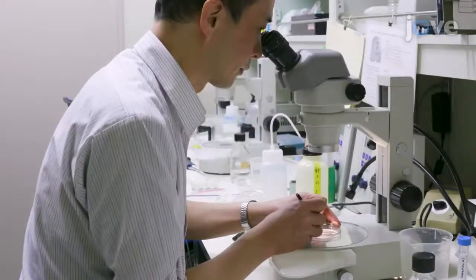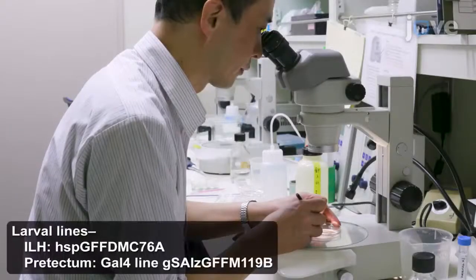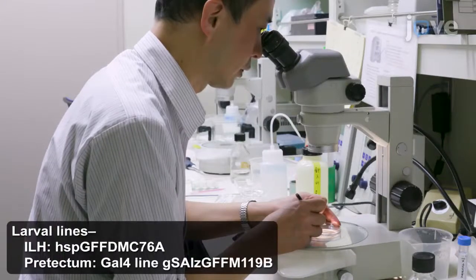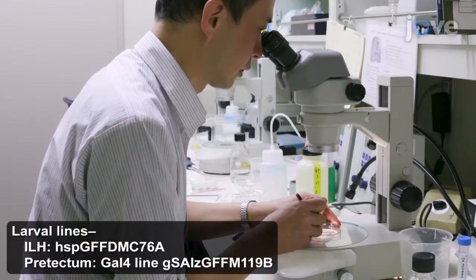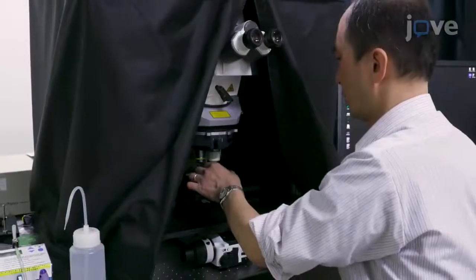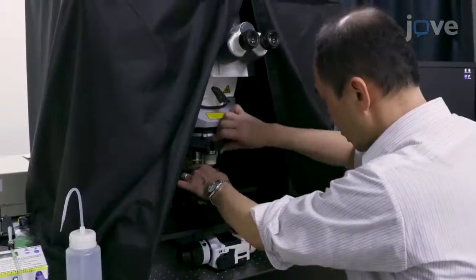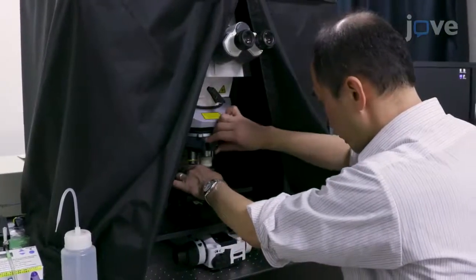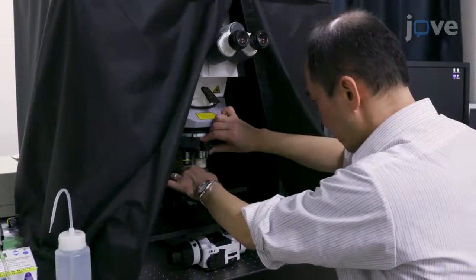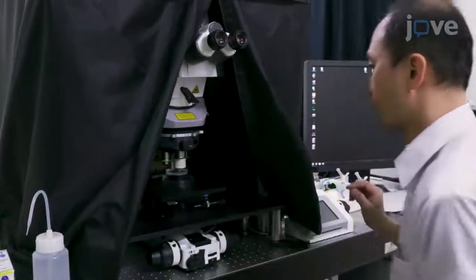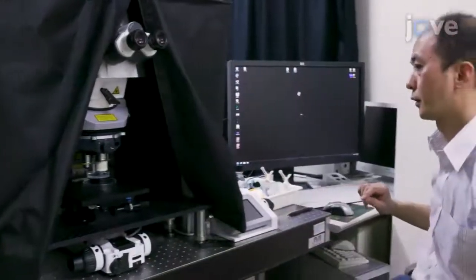After raising larvae and mounting them in 2% low-melting agarose according to the TEX protocol, place the agarose-embedded larvae under a 2-photon laser scanning microscope and start the microscopy system.